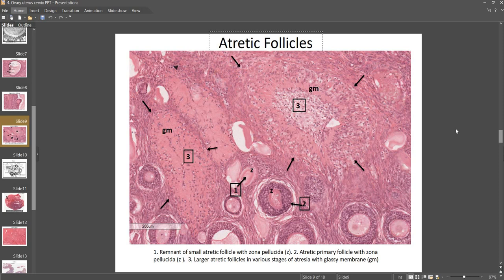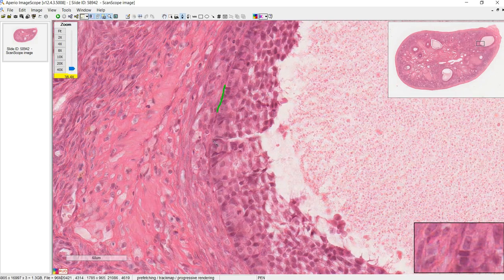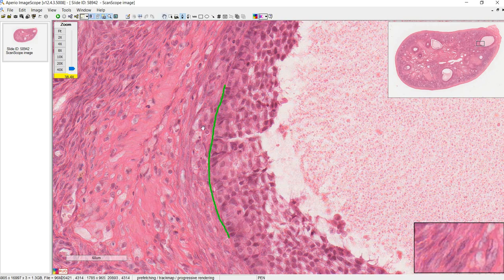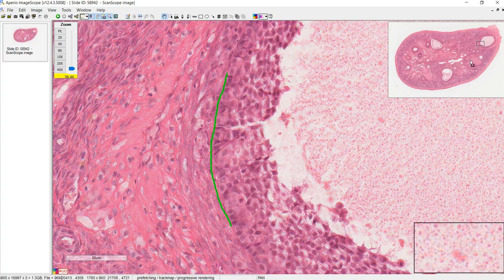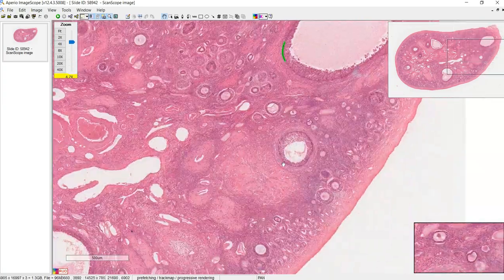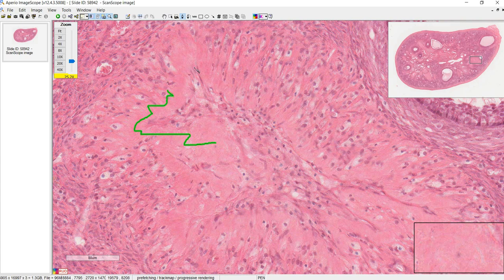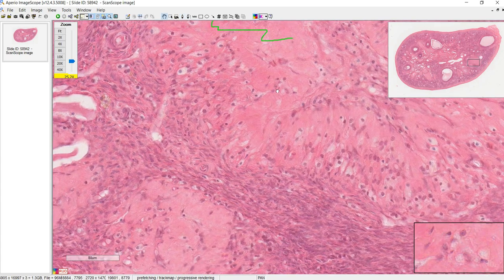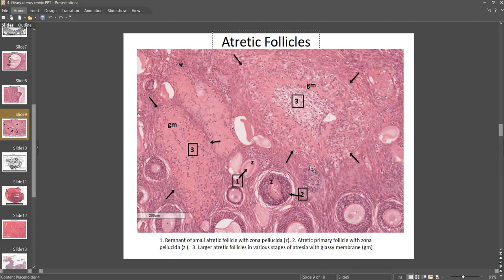Now let's talk about the atretic follicles — these are the ones that are degenerating because they didn't make it to be the one dominant follicle that ovulated. One way to identify them is if you see a glassy membrane. That thin membrane between the theca cells and granulosa cells, which you generally can't see in light microscopy, has thickened and expanded as the follicle degenerates. This pink mass here is an example of the glassy membrane of an atretic follicle.